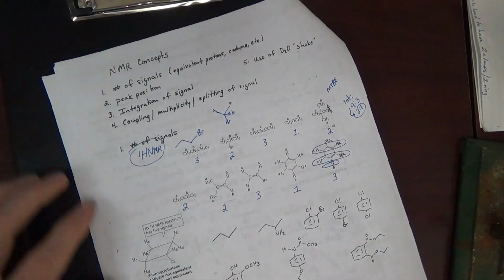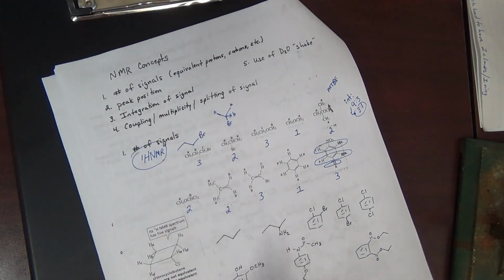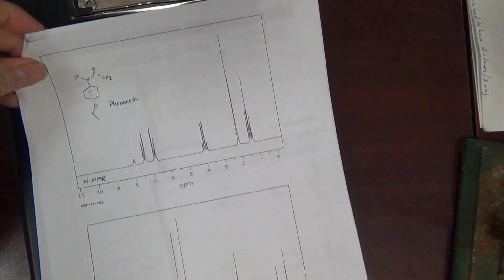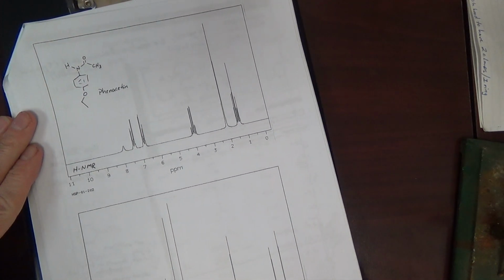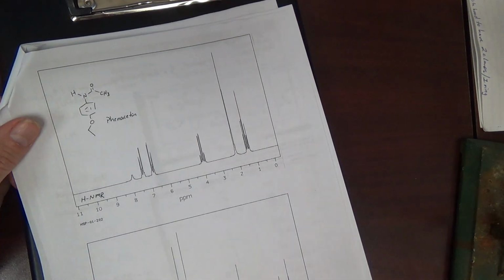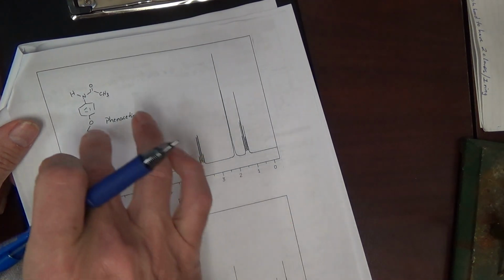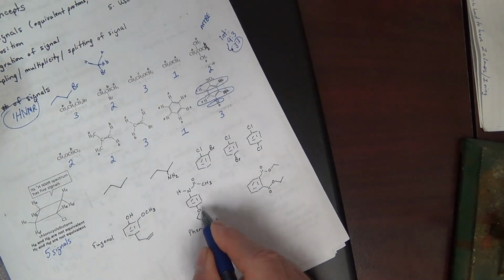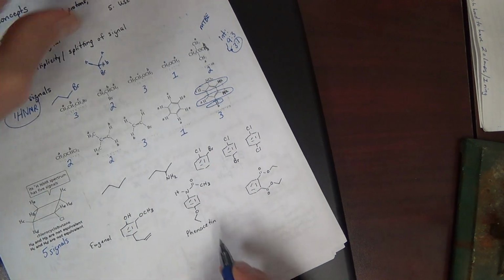Okay, the next thing we're going to look at is peak position. Where do we expect these signals to occur in the NMR? But before we move on to that, I'll give you the NMR of phenacetine here. Number of signals. You can't cheat because the number of signals are shown over here.